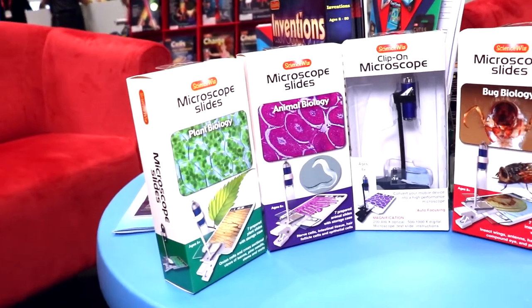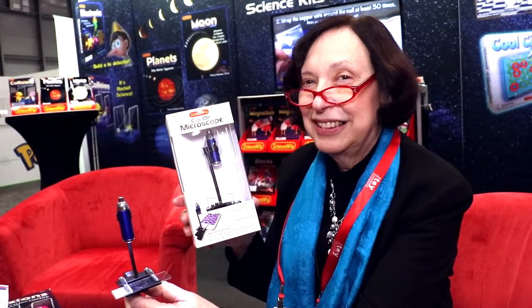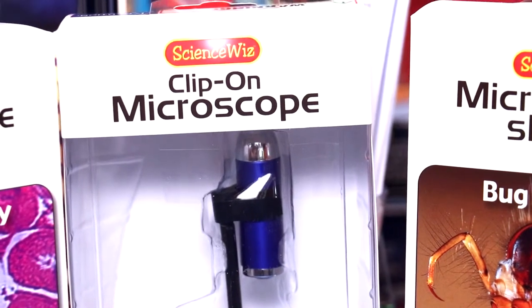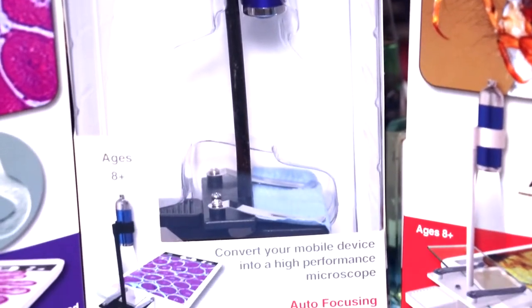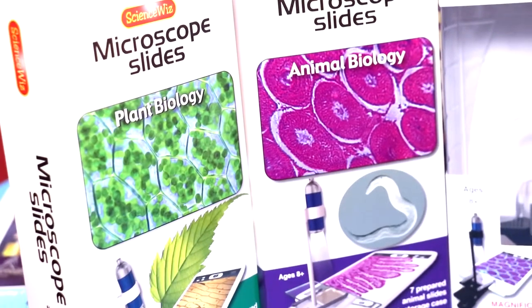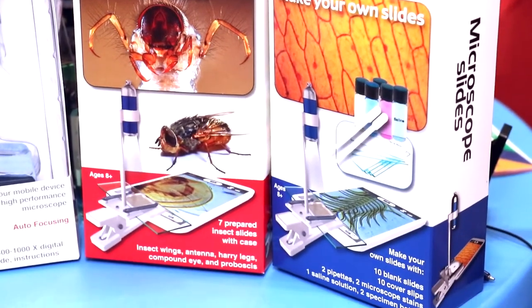To get a large working distance lens above a regular microscope would cost a lot of money — in the thousands of dollars range — and this is $29.95. We have all these slide sets in animal, plant, insect tissue, and make-your-own slides. The microscope won a blue ribbon as a choice of stores in the hardware trade last year because it really is a breakthrough item, since the magnification is actually in the microscope range. It does break down so you can put it in your pocket. You should be careful with the lens because it is a high precision lens, and if it gets dusty you're going to see the dust — they're going to look like great big clods. Visit the website at www.sciencewiz.com.